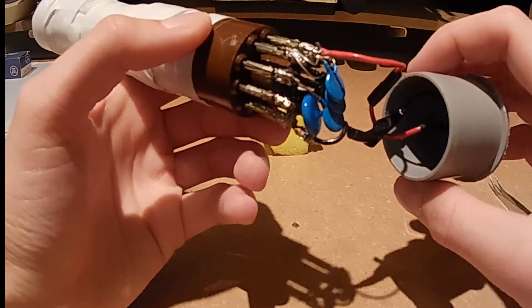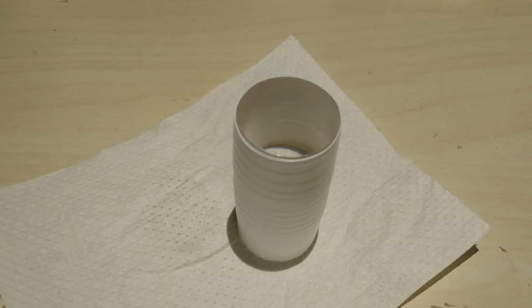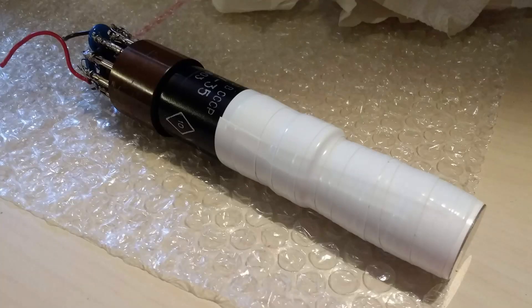At the back we also see the voltage divider network and some capacitors. The first step was to tape white electrical tape around the BC-408 plastic scintillation material. After taping the scintillation plastic, I mounted it to the photomultiplier tube with a coupling compound and taped it to the photomultiplier tube.